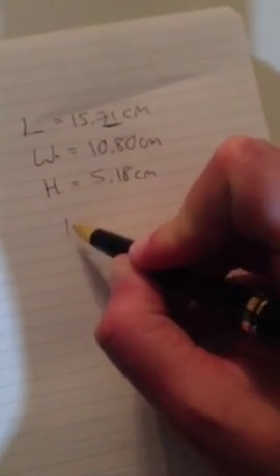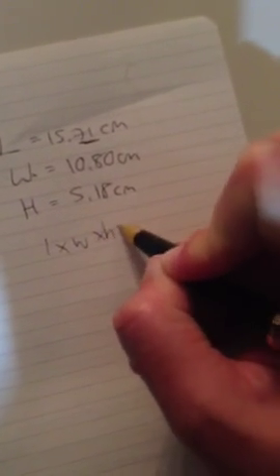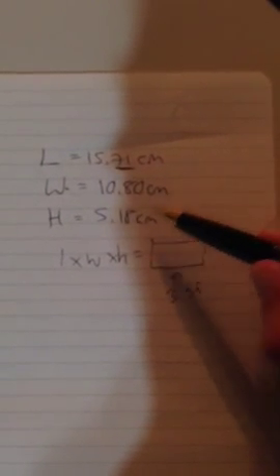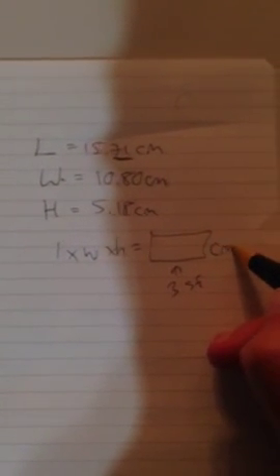So now using these results, you're going to be calculating the volume. And the formula will be length times width times height. So you're going to multiply your 3 numbers by each other. Your final answer should have the same number of significant figures as the number with the fewest. So here we have 4, 4, and 3. So your answer will have 3 significant figures. And your units, if we multiply centimeters by one another 3 times, will be cubic centimeters.